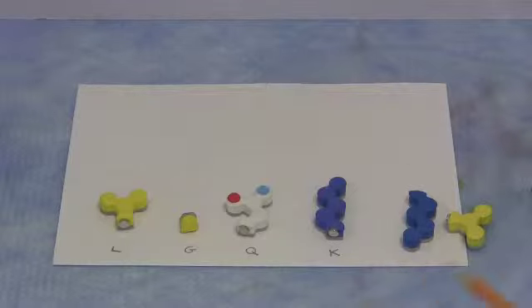The stationary phase, that is the paper, is actually water. That is water bound to the cellulose molecules on the paper. Our mobile phase is butanol acetic acid water. So our stationary phase is very polar, and our mobile phase is relatively non-polar compared to the stationary phase.